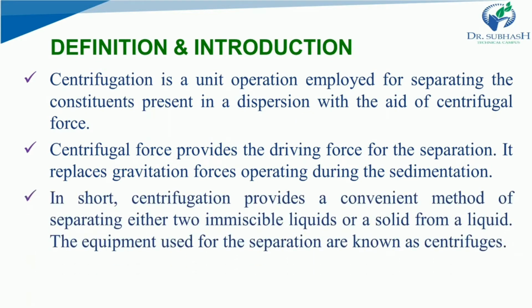In short, centrifugation provides a convenient method of separating either two immiscible liquids or a solid from a liquid. The equipment used for separating are known as centrifuges, right? So please remember this slide. You can pause the video to understand it yourself. Read aloud the definition so that you get a proper idea of it, right?